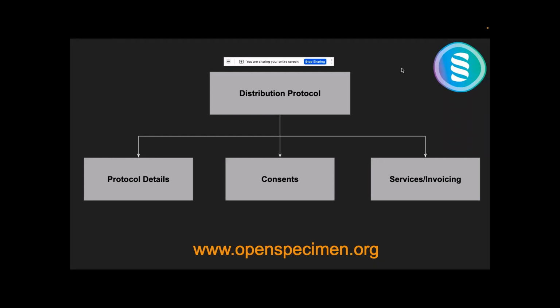It contains information like which institute is going to receive the specimen, who is the principal investigator or the researcher who has requested the specimens, what type of information you need to capture, and what type of files you also need to send. All such information can be pre-configured, and that comes under protocol details.